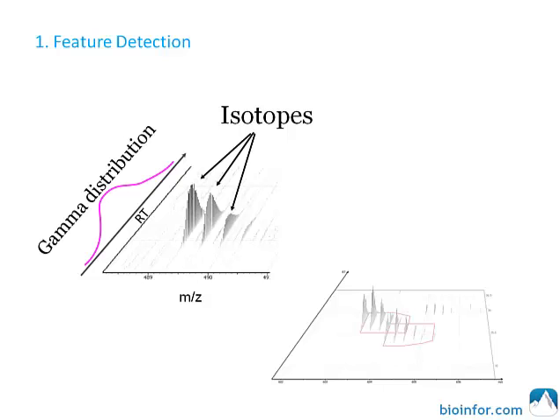The first step is feature detection. A peptide feature is defined as a group of peaks in a heat map characterized by elution patterns in terms of retention time and isotope patterns in terms of mass-to-charge. The deconvolution of overlapping peptide features and retention alignment between runs are the key factors for data analysis.